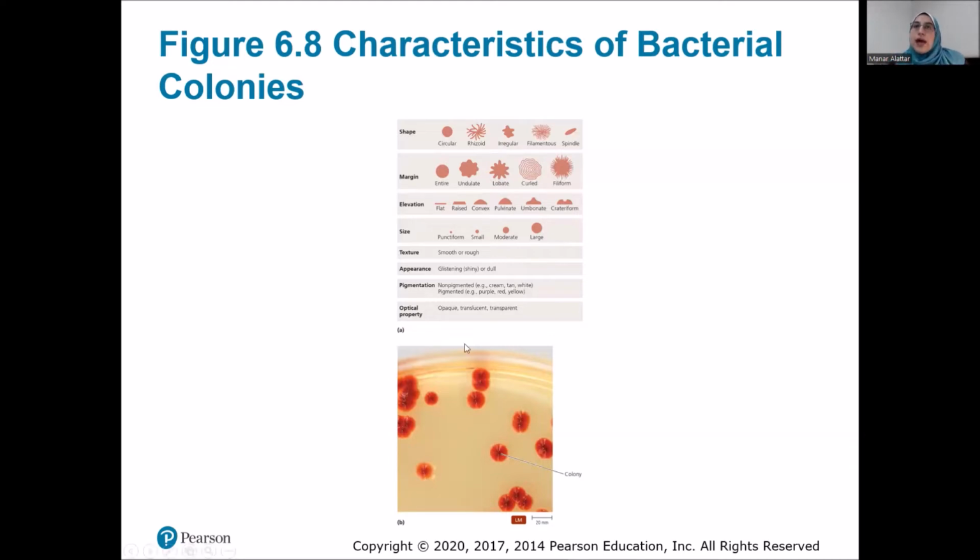And so that is kind of an initial step in identifying microorganisms, but you need to continue then to utilize different methods to understand exactly what's going on with each one or be able to identify them. And so essentially, this lecture is a summary of some of the techniques that we're going to be using in our actual lab to go from pure colony, which is where you're at now, and then identify various characteristics of those colonies. Okay.